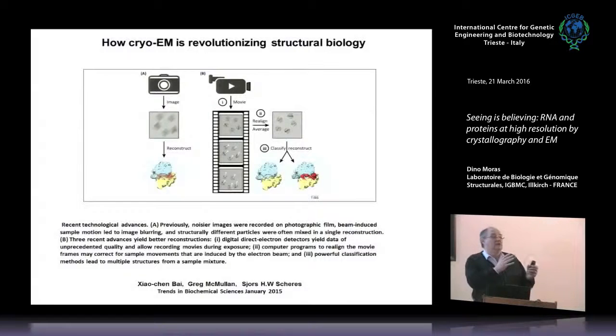That is, I would say, about the limit that one can reach in terms of resolution with experimental data. Of course, that level of resolution cannot be obtained routinely. It was exceptional. There are maybe 5 enzymes or proteins known at that level of resolution. But there are several thousand known at a worse level, we should say, 2, 3 angstroms, or 2 angstroms, which is quite good enough to interpret the mechanism at the molecular level. And until, let's say, 2 or 3 years ago, crystallography was the only experimental method that allowed you to reach that type of information.